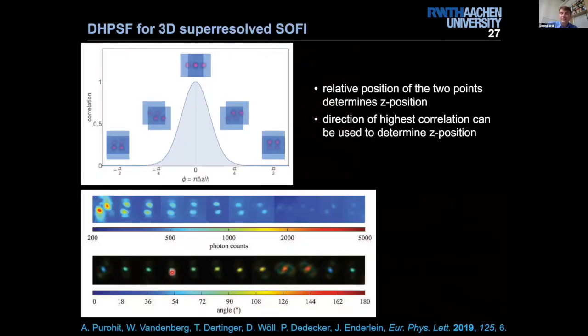And I show you this here in this slide, because if you move your image by a certain distance, and you do this in the right direction, you hit with the loop of your image the other loop of the shifted image. That means you get a correlation when you do a shift in this direction.